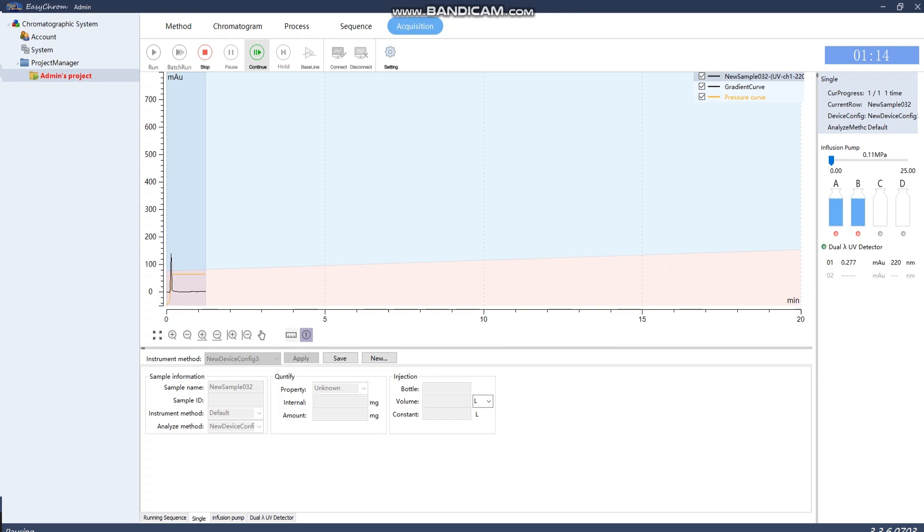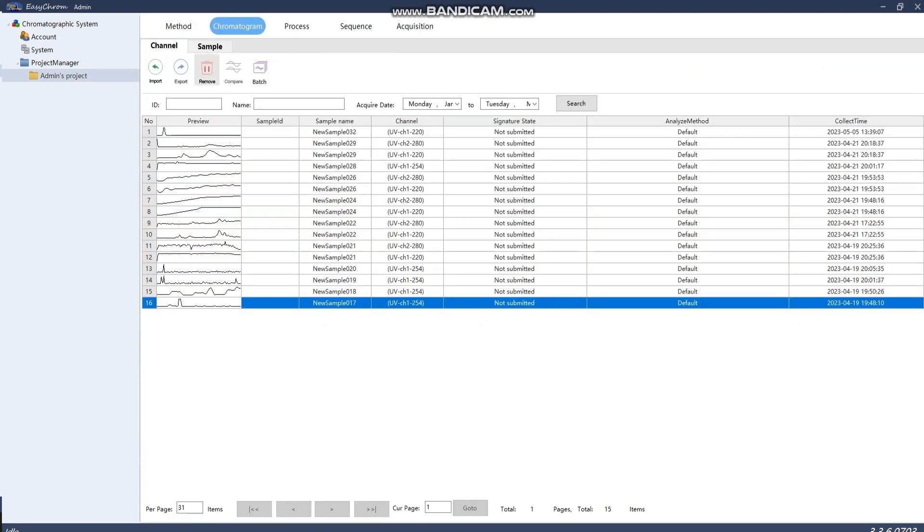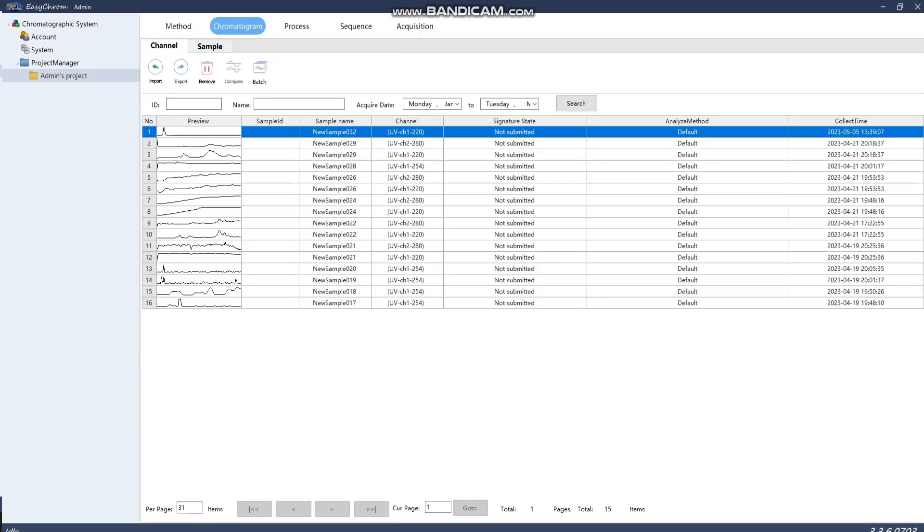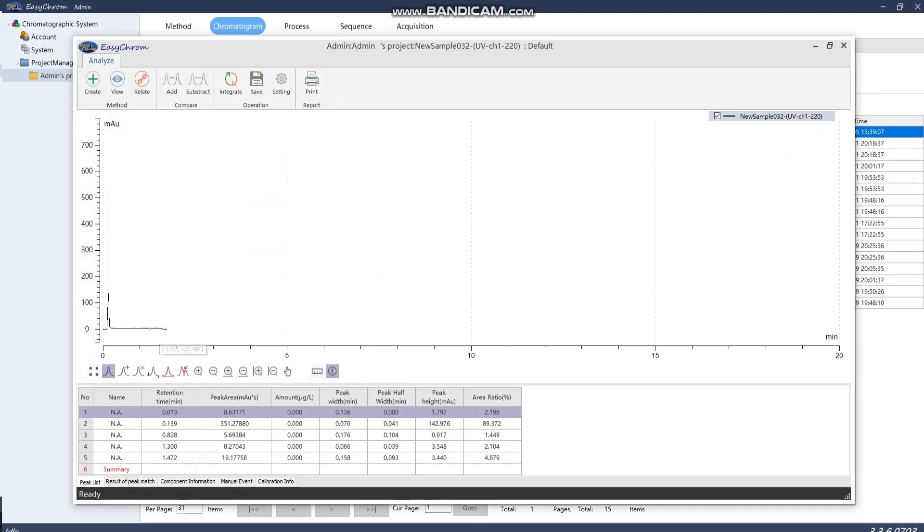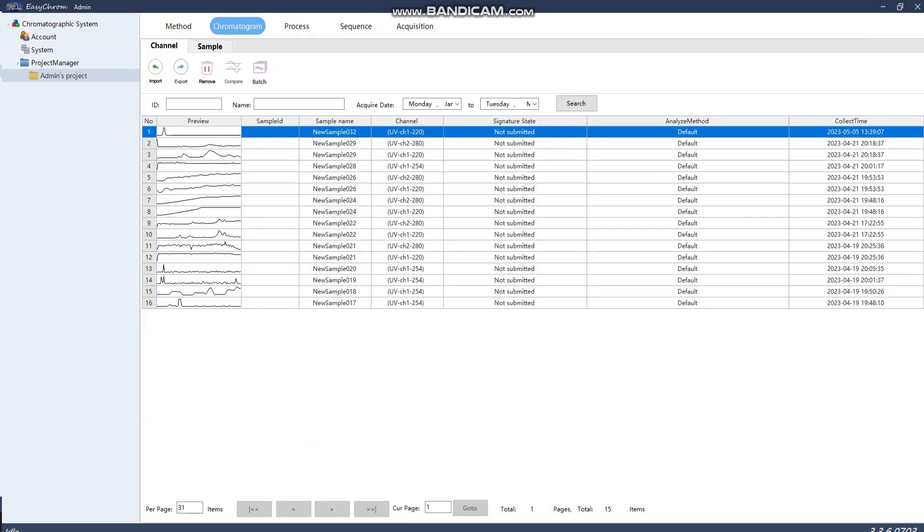Once you're finished, select Stop to stop your gradient and pump, and select Save to save it. Your chromatogram is automatically saved. Select Chromatogram to see your most recent one, which will be the one you just finished.